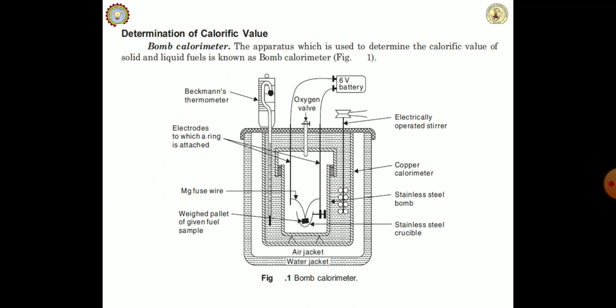The apparatus used to determine the calorific value of solid as well as liquid fuel is known as the bomb calorimeter.